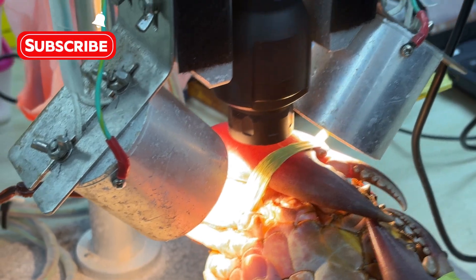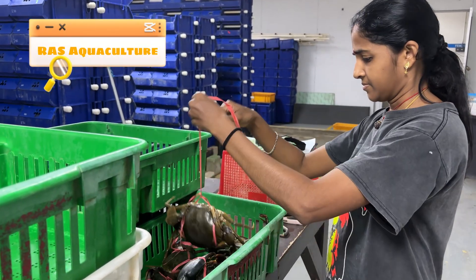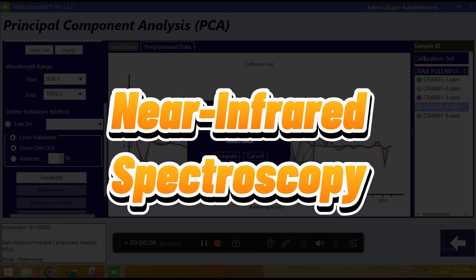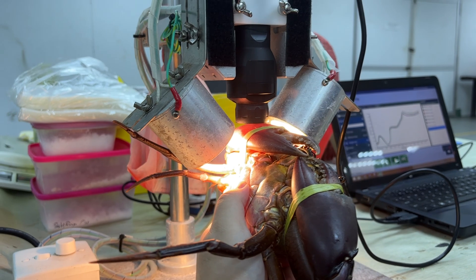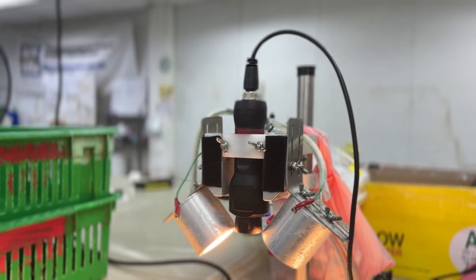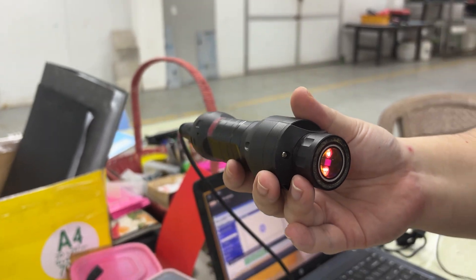Welcome back to the RAS Aquaculture channel. Telling the difference between a meat crab and a water crab can be quite difficult. After searching for a reliable solution, we discovered that NIRS — near-infrared spectroscopy — is a smart and effective choice. Today, we're going to show you how we use NIRS to test and compare meat crab and water crab. This technology helps us evaluate crab quality quickly, accurately, and without harming the crab. Let's take a look.